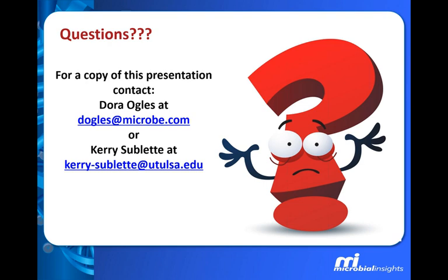Well, thank you very much, Kerry, for the presentation. It's an excellent overview of all the tools and the way we can use the BioTrap samplers. So the first question we have here is, has anyone done a side-by-side in situ test of a BioTrap versus plain water samples to be able to compare as far as detecting and quantifying a particular organism or genes and how that looks different in a soil or a groundwater and a BioTrap sampler?